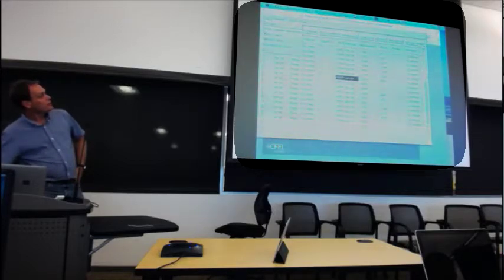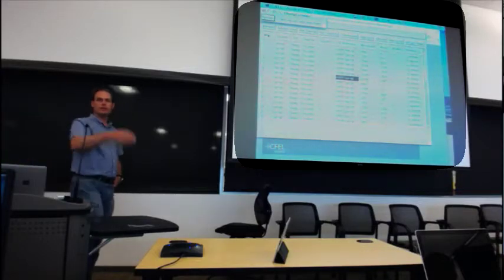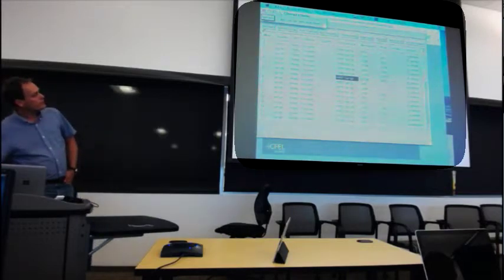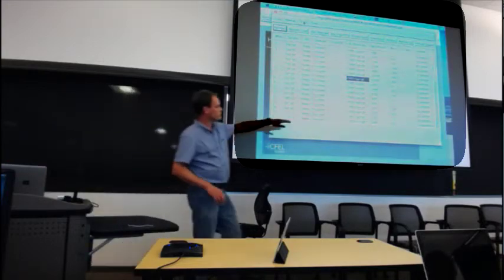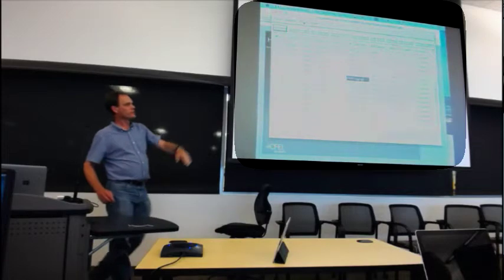Unlock that. And then you start this little beast, which is really just a script that goes through and looks at the HDF5 files, the XTC files. Every minute it does that, and it updates things here. And of course, I have all of this data sitting here because I've got all of the directory. You will probably, at that point, end up with all of those going blank.